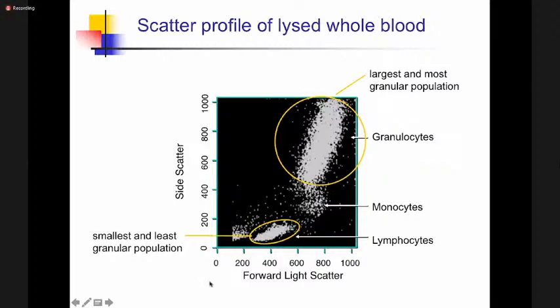The side scatter here tells you the proportion of the cells which would be distributed. Like I mentioned to you, cells could be scattered on left, lower, or I mean, you put your hands and look at this square diagram between you, and you can be at the center and look at the right side of the square or the left side of the square. The right side of the square still would be having upper right and the lower right, just like you have on the left side would be having lower left and the upper left. So when I'm talking about the forward scatter is that scattering of the cells towards the horizontal.